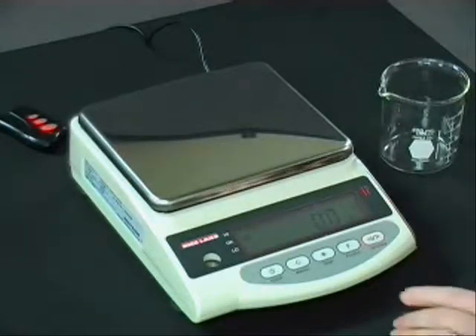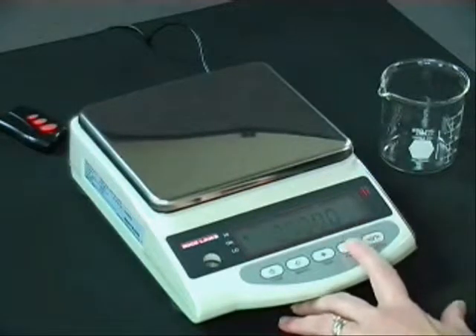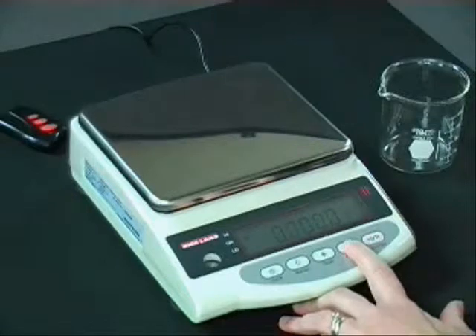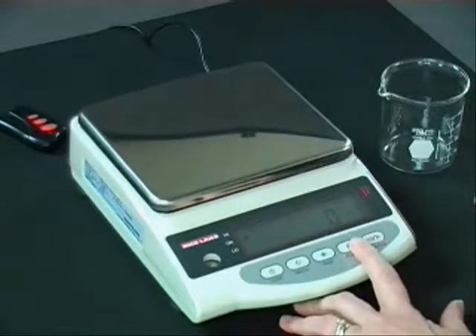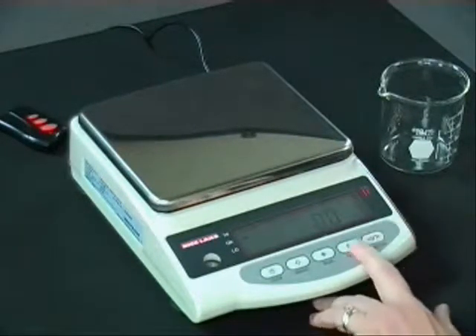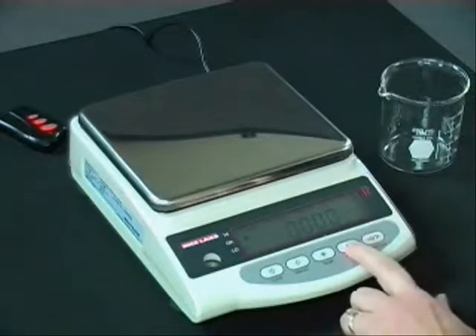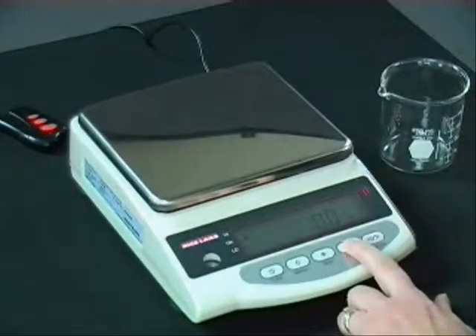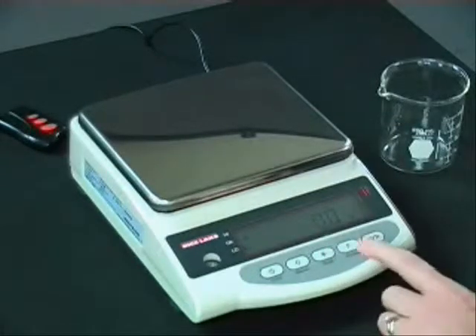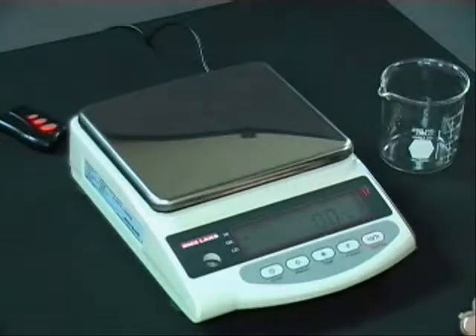I also wanted to show how easy it is to change from one unit of measurement or mode with this balance — you do that by simply pushing the function button. Pushing it now, I'm weighing in pounds. When I push the function button again, I can be piece weighing or doing count mode. Pushing it again, I'm doing percentage weighing to see the percentage of what I want. And last, I can weigh in ounces. It's very easy to set up your different units of measurement, and you can choose which ones to display, or turn off those you don't need so your balance is set up for your application the way you want it.